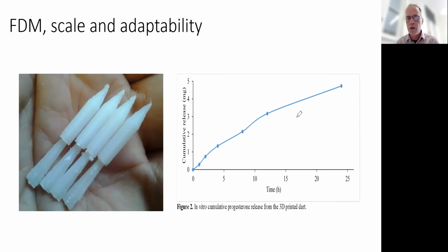So the blending of the drug and the polymer is going to be conventional plastics blending equipment, and the printing is going to be anything from a home hobby printer through to an industrial precise 3D printer. You can print one insert as easily as you can print 100 at a time. And so scale can be influenced, changed very easily.